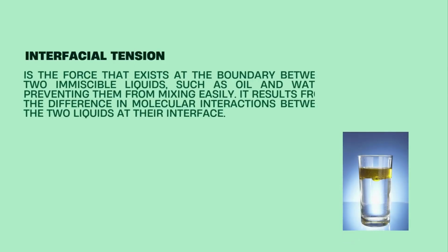On the other hand, interfacial tension is the force that acts at the interface between two immiscible liquids like oil and water. It helps explain why different liquids don't mix easily and how they interact at their boundary.